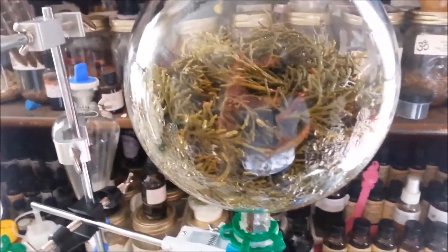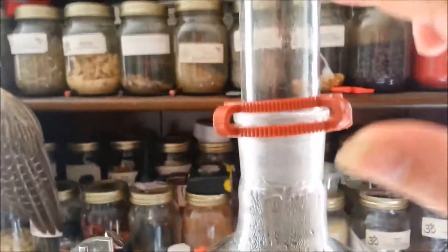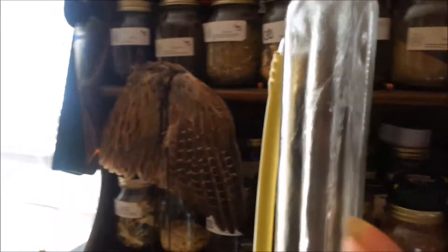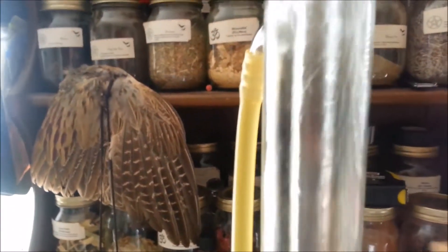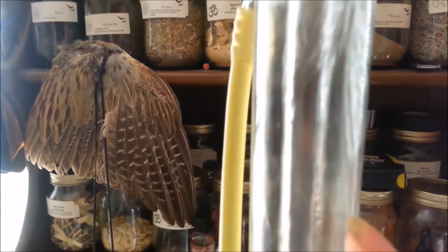I'm distilling some juniper berry today. Once it goes through the plant material, it will keep rising, carrying the oils from the plant through the still head and back down through the condenser. The condenser is two tubes — one is the outer tube and one is the inner tube.